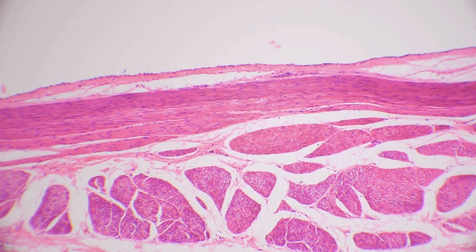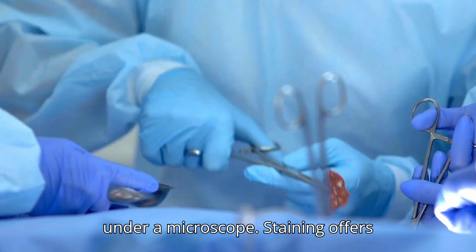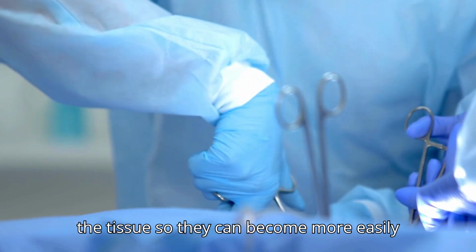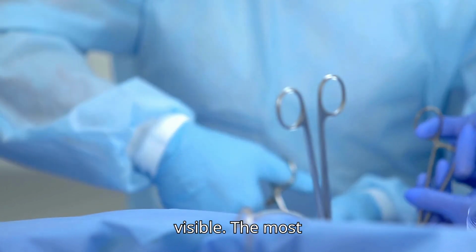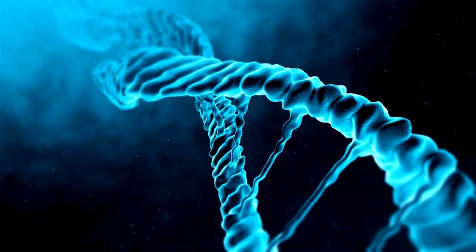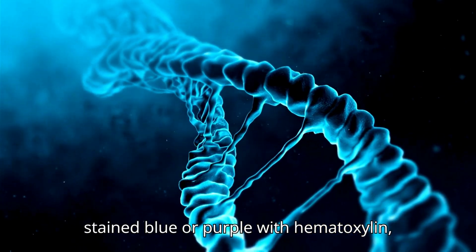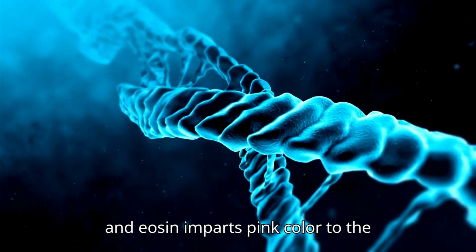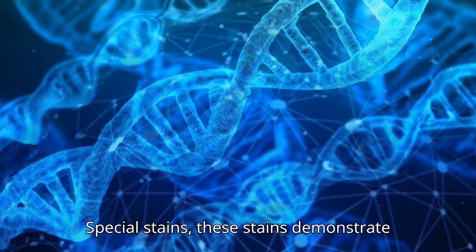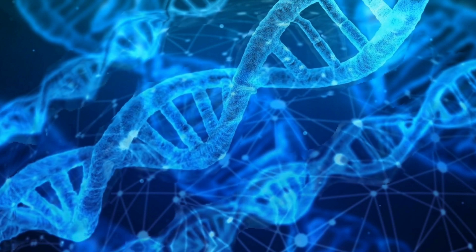5. Staining. Goal: tissues are typically nearly invisible under a microscope. Staining offers contrast in color to specific parts of the tissue so they can become more easily visible. Common stains: the most common stains used are the following. Hematoxylin and eosin, H&E: nuclei are stained blue or purple with hematoxylin, and eosin imparts pink color to the cytoplasm and extracellular matrix.